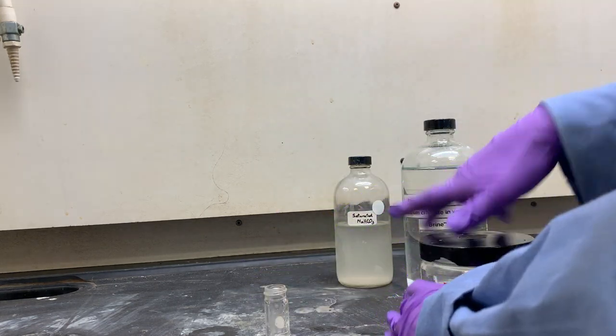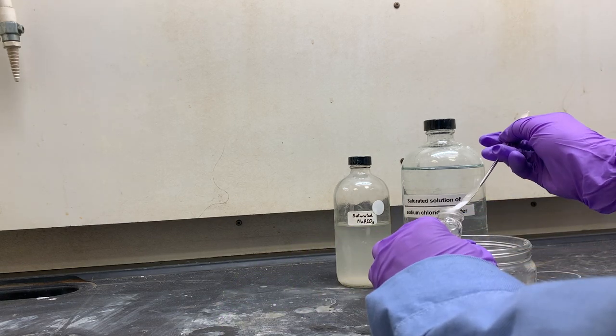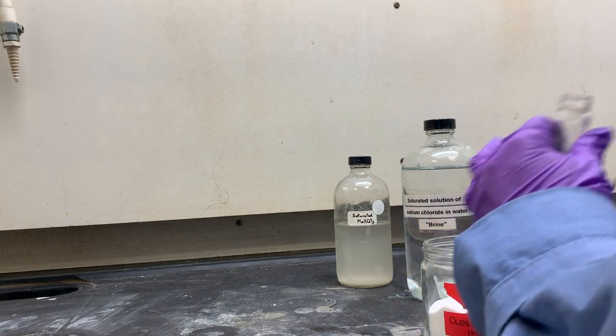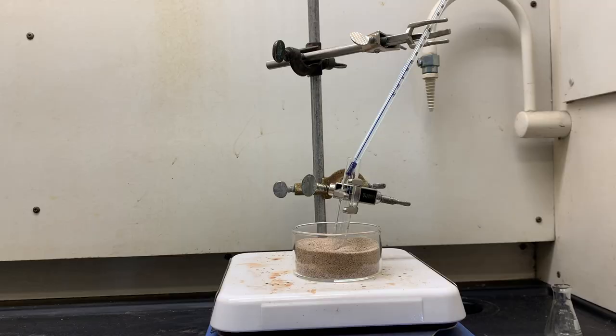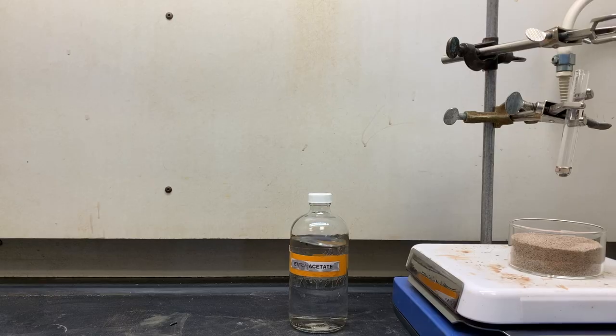Heat the mixture until the temperature of the vapors is above the boiling point of m-Xylene, or over half of the liquid has evaporated. Excess m-Xylene remaining in the product will interfere with correct interpretation of the IR, so it's important that the product is concentrated.